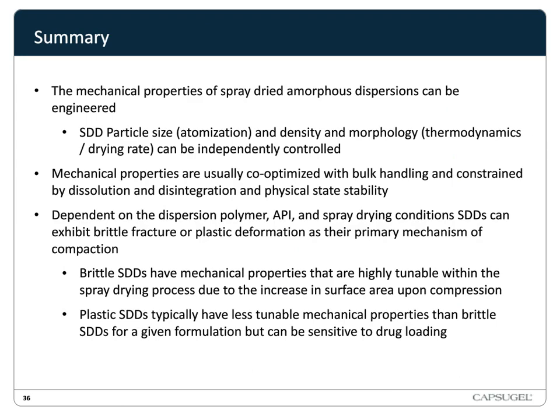Okay, so in summary, the mechanical properties of spray-dried amorphous dispersions can be engineered. SDD particle size and density and morphology can be independently controlled. And the mechanical properties are usually co-optimized with bulk handling and constrained by dissolution and disintegration and physical state stability of the SDD. Now, dependent on the dispersion polymer, API, and spray drying conditions, SDDs can exhibit brittle fracture or plastic deformation as their primary mechanism of compaction.